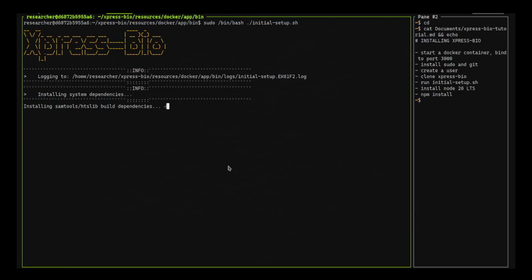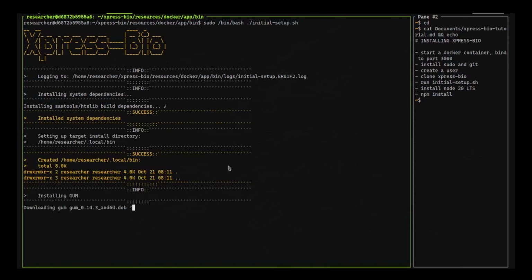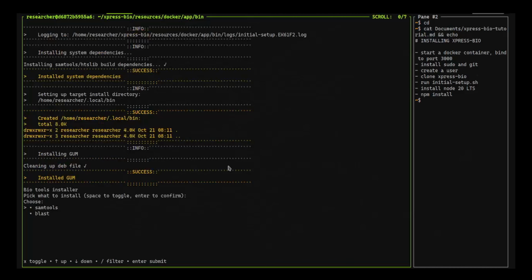The process takes around, as I said, 10 minutes, depending on your internet connection, depending on your CPU. I'm running everything on a mid-range laptop, so it's not really requiring a lot of hardware to get everything running. You could run this on a 10-year-old device, no issues with that.